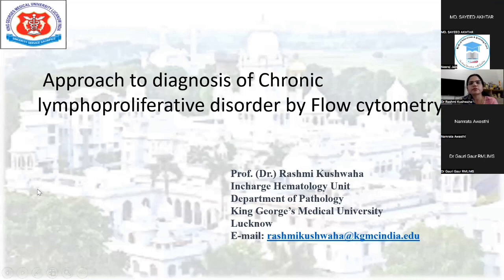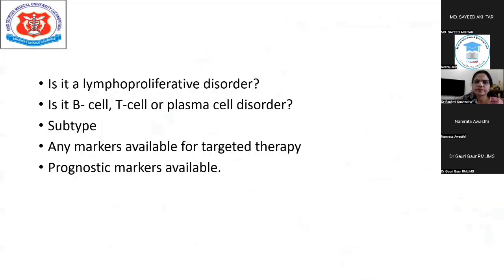Second, the flow cytometry helps us to detect the presence of the weaker antigens. Now, these weaker antigens can be lost during immunohistochemistry when we do the tissue fixation and processing. So these are certain advantages of flow cytometry over immunohistochemistry. So let's proceed with the flow cytometric approach.